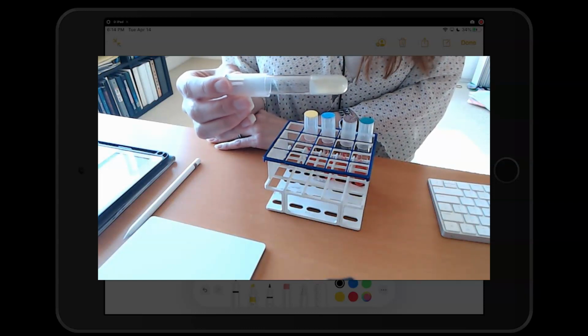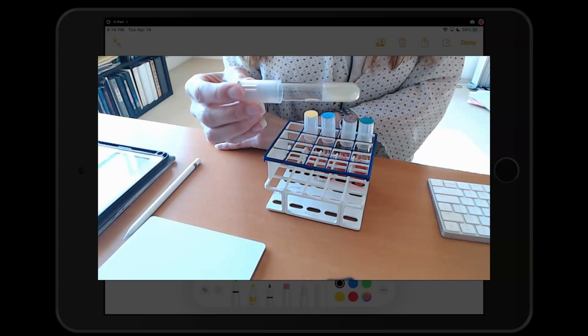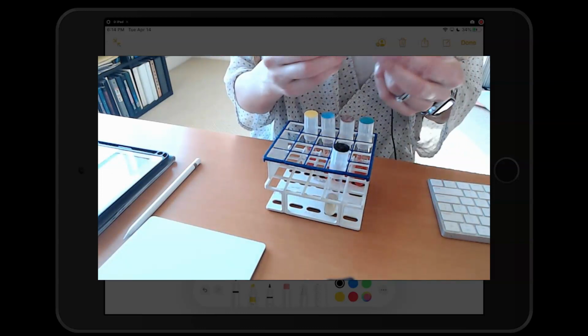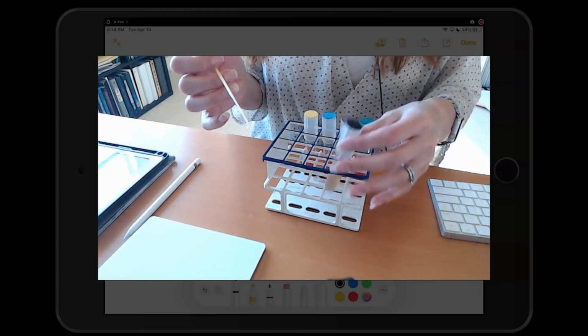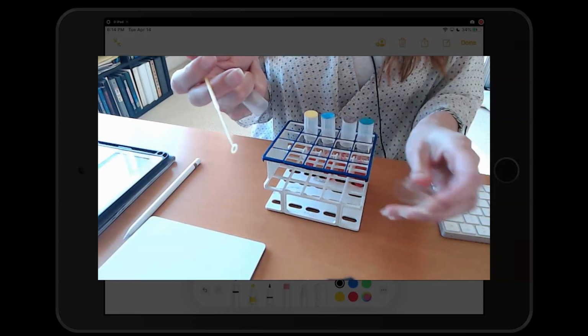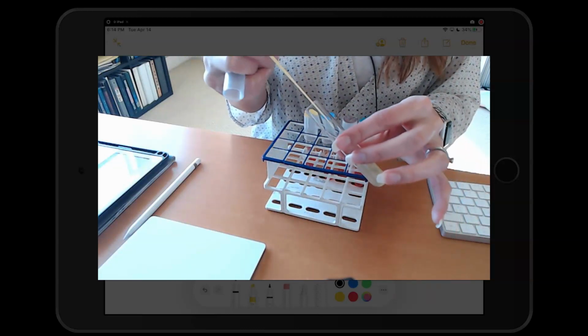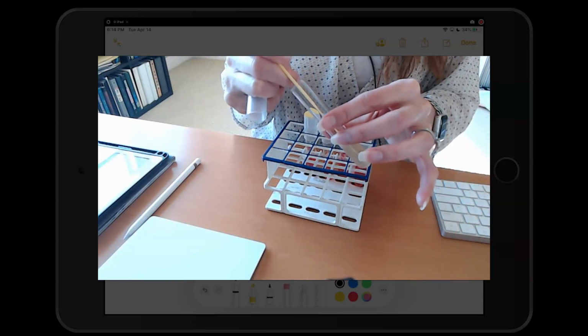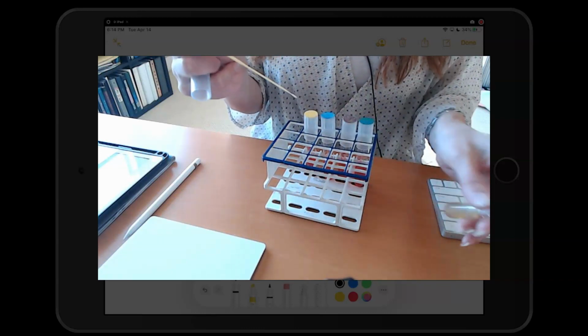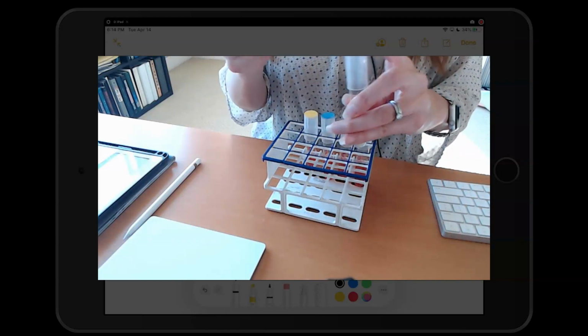So the way we do this is we get a heavy inoculum, under sterile conditions, right? We get our culture, we get a heavy inoculum, flame the neck of the test tube, and we actually stab our gelatin three-quarters of the way, flame, cap it, and we incubate it at the unknown's optimum growth temperature, just like we did with the carbohydrates.